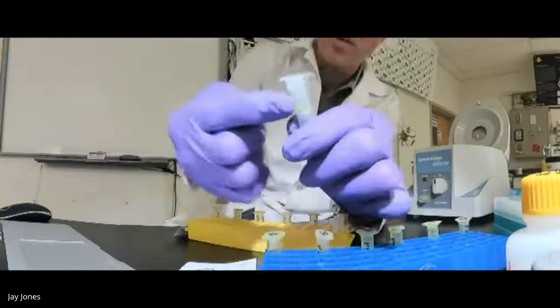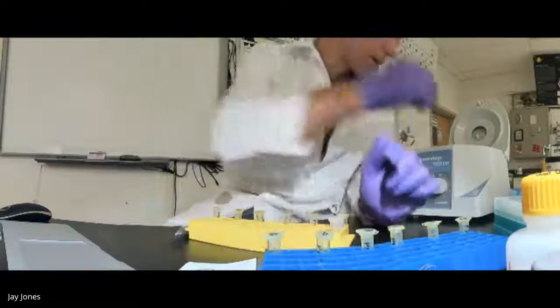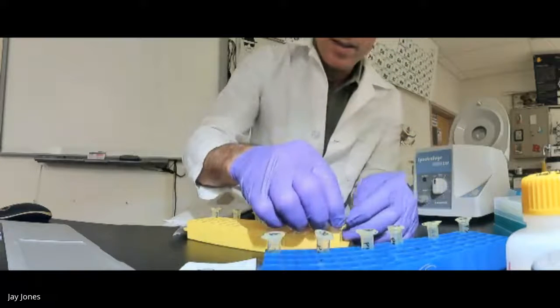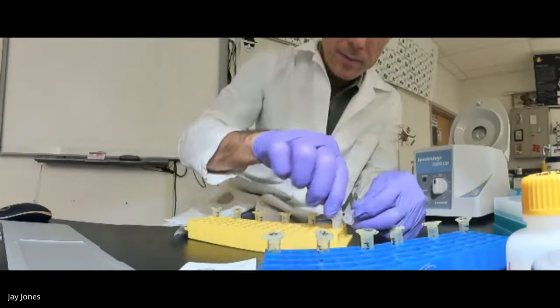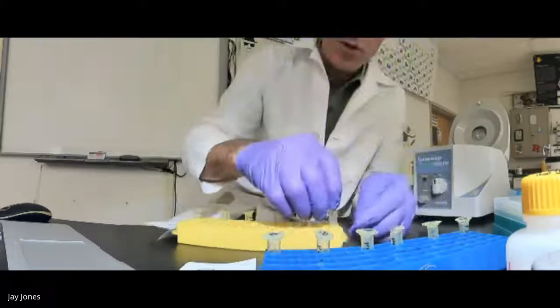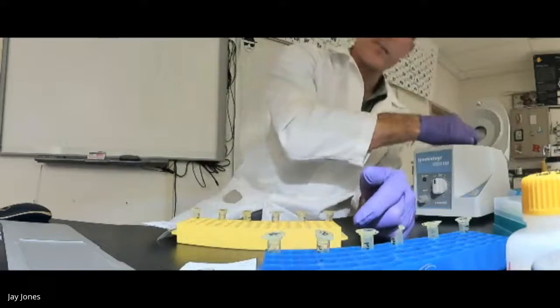So you can see the liquid in the column. It's going to be pulled through the column, and the column is going to grab the plasmid DNA. This is called the mini prep. We're doing a miniature preparation of plasmid DNA. All right. Let me show you guys what I did.